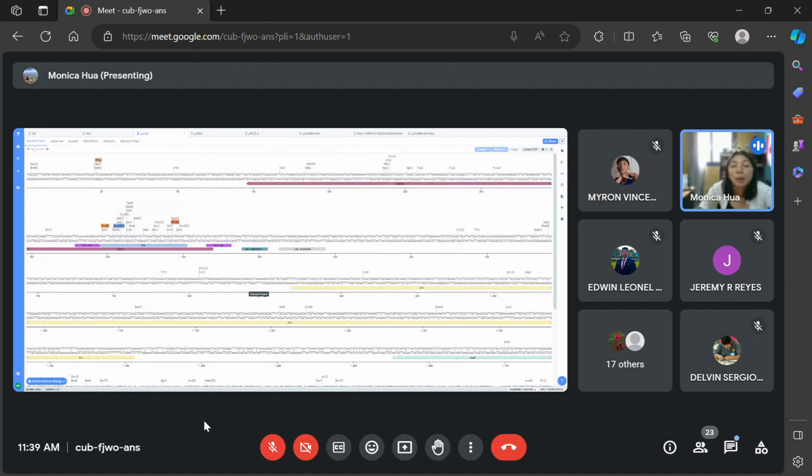This part is the tricky part. Go to the plasmid where you have chosen. There will be a site, for example, if I choose EcoR1, all right? What I want you to do is delete those sequences and insert your sequence, okay?